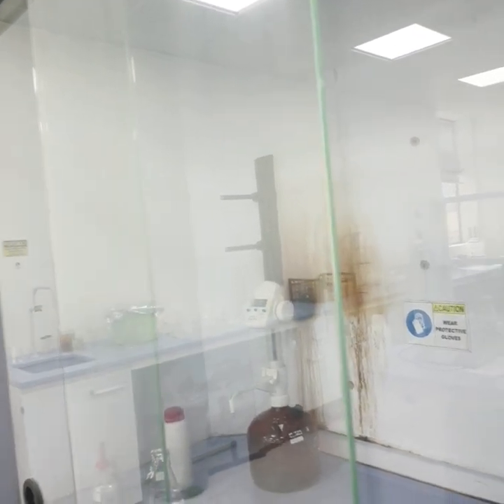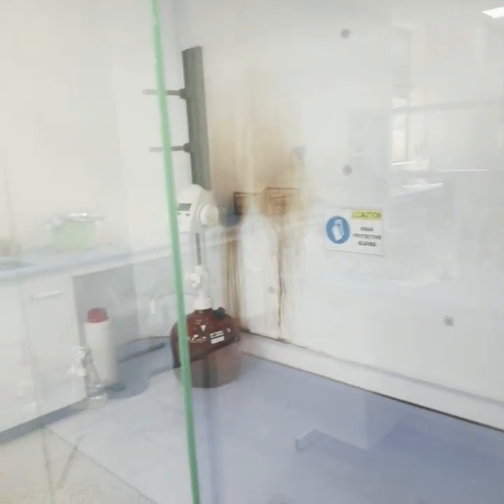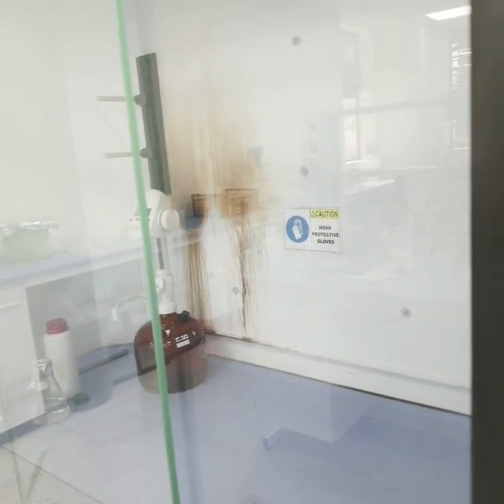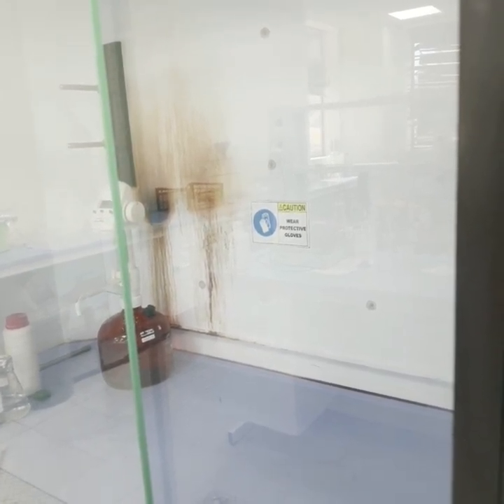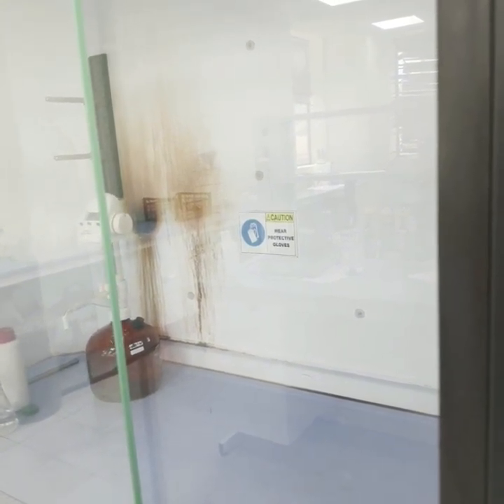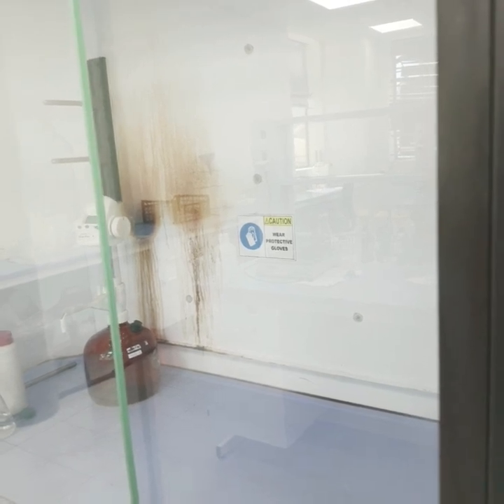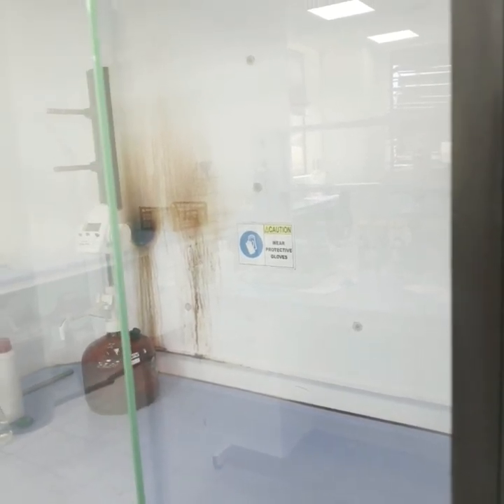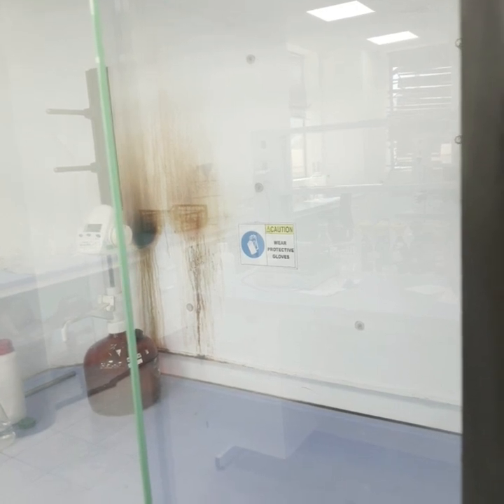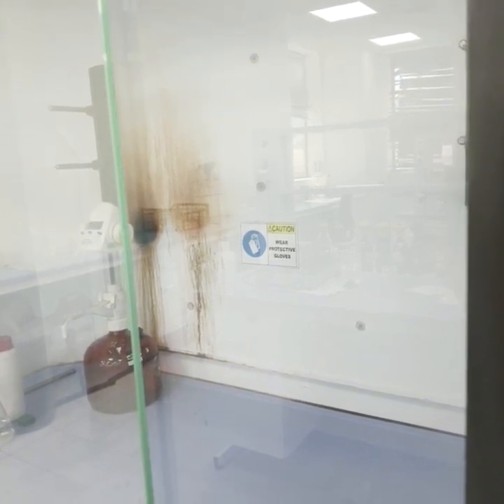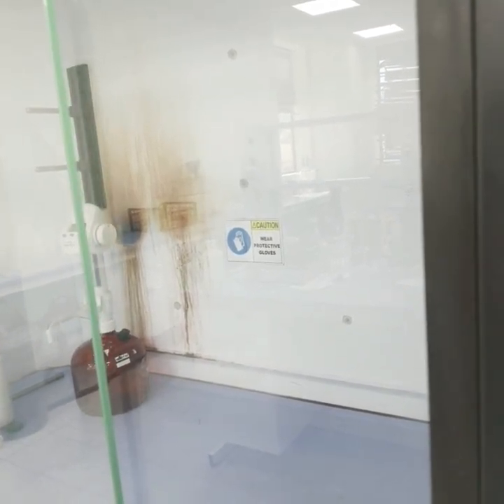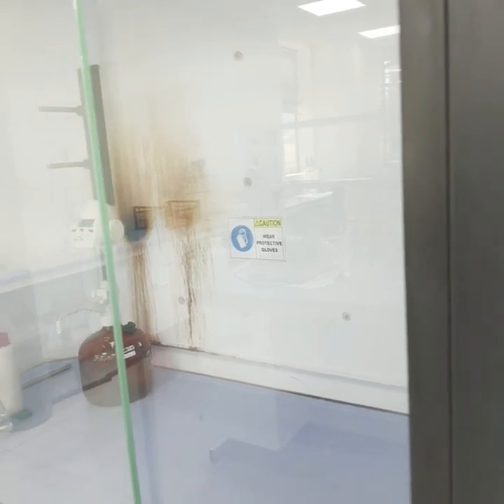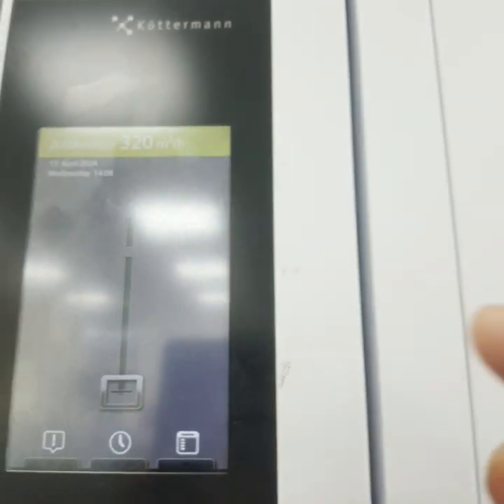In fume hoods, we handle chemicals with high acute toxicity — carcinogens, mutagens, or chemicals with high exposure risk, defined as NFPA health rating of 3 or 4 — as well as flammable, corrosive, irritating, reactive, or potentially exploding chemicals.